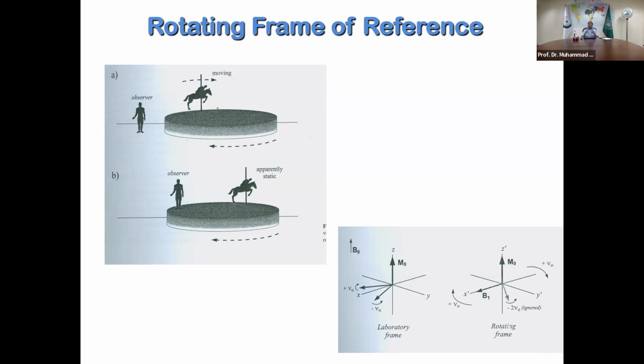Remember that in an NMR experiment, you need to play with them. NMR spectroscopy is playing with pulses and playing with the magnets, these magnetic vectors. In many experiments which you will see after this lecture, you would appreciate that the exact location of these vectors on the XY plane is so desirable to understand, because only then would you be able to give the second pulse.